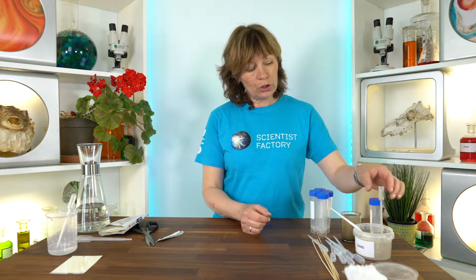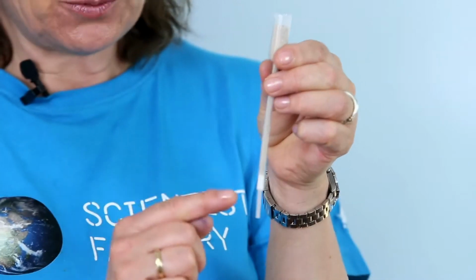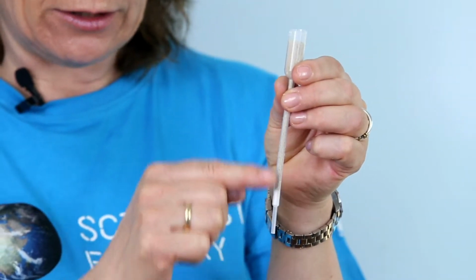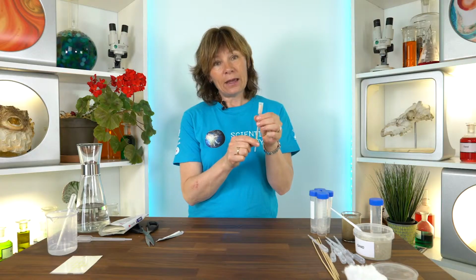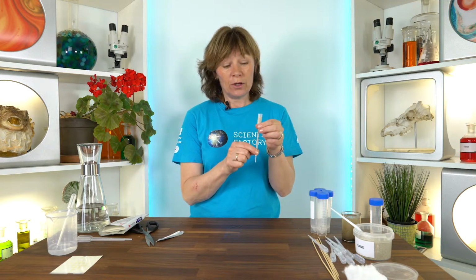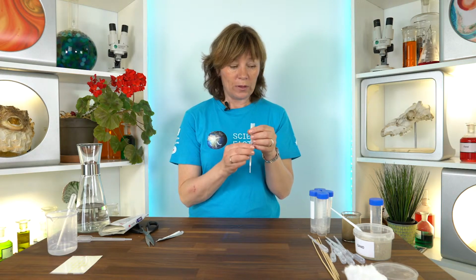And we will purify the water using small columns with sand and some cotton at the bottom to prevent the sand from sliding through. And actually this way of purifying water is very often used in, for example, refugee camps, etc. Sand can be a very good material to purify water.